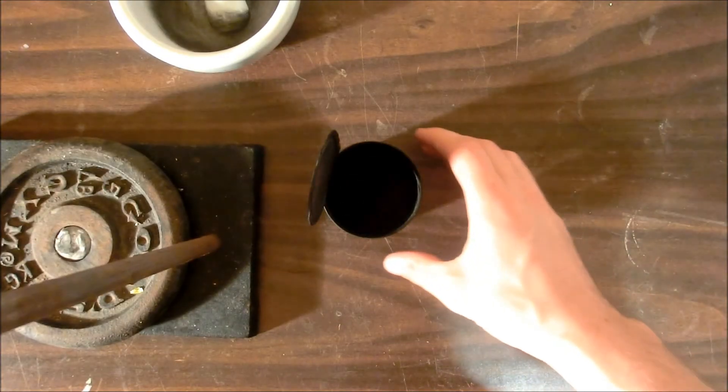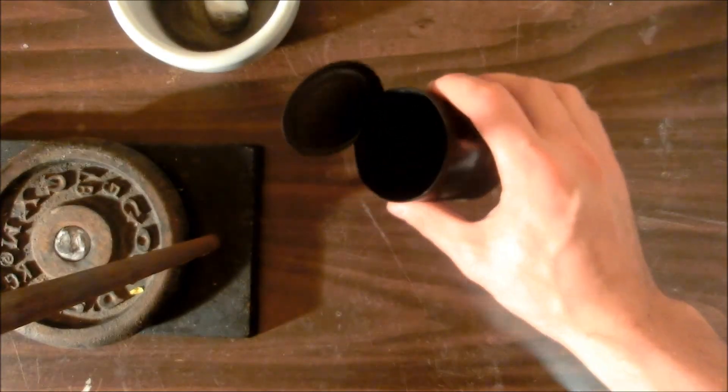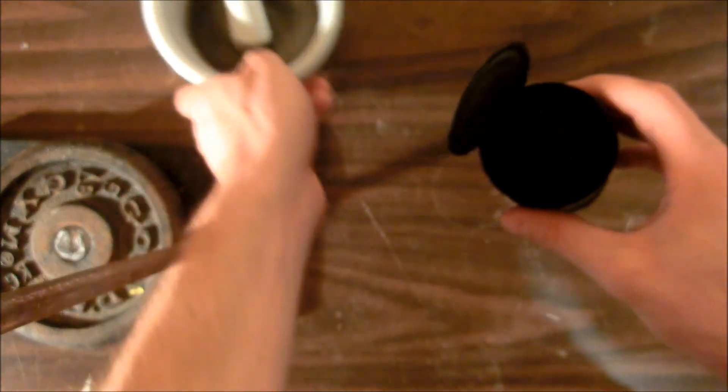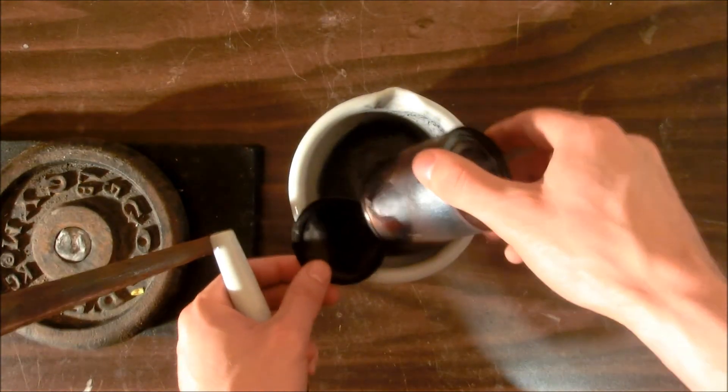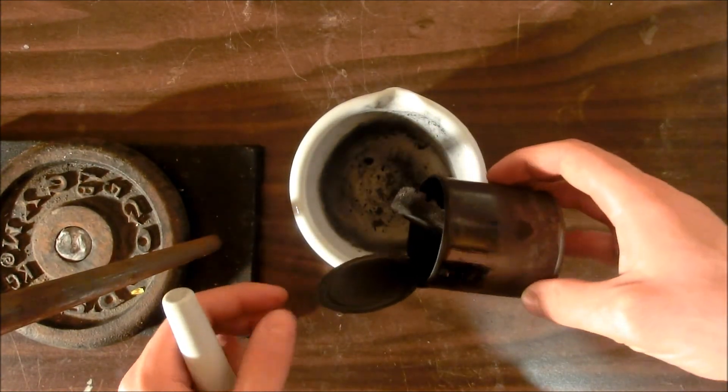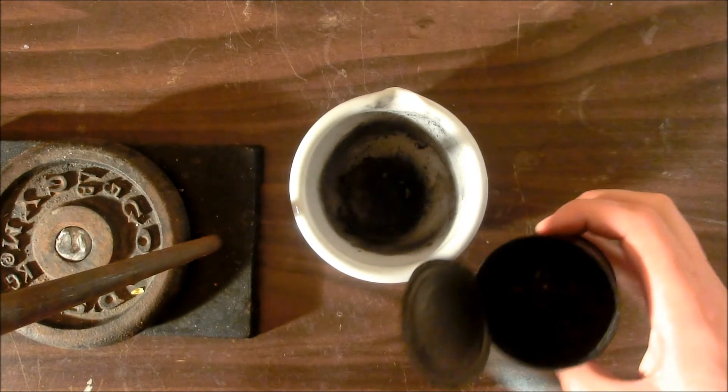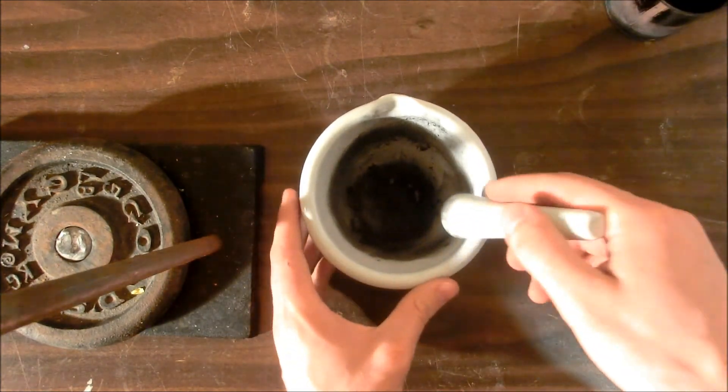After the can is cooled, you should have a nice solid cake at the bottom of the can. Dump it out into the mortar and pestle and crush it up, and our iron sulfide will be ready to be used in our hydrogen sulfide generator.